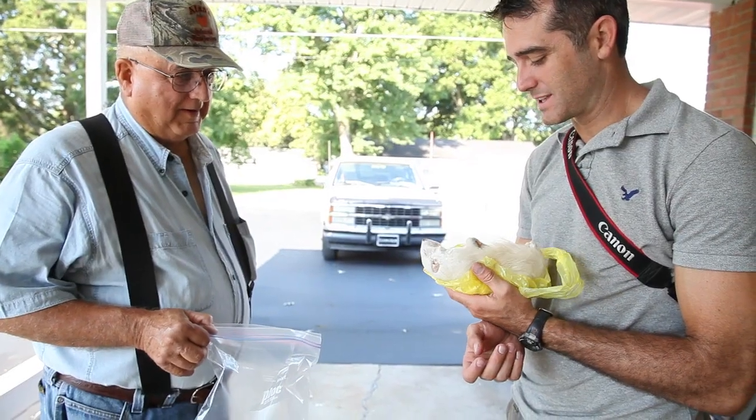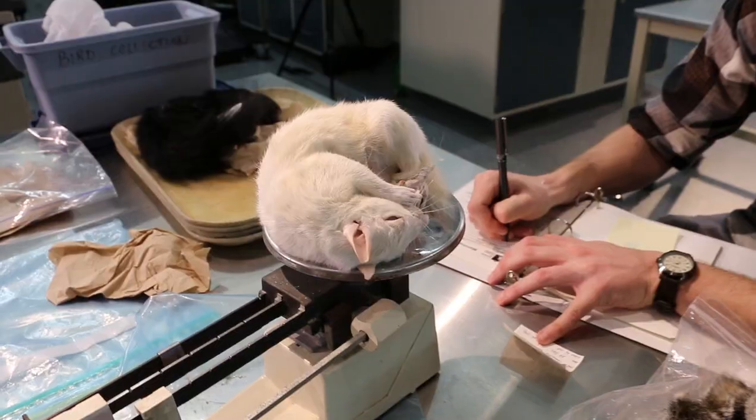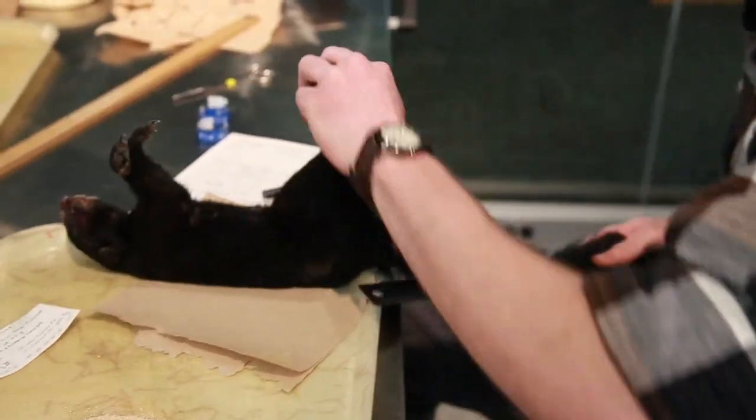The first stage when you're making a museum specimen is the data stage. You need to know where the animal came from. You've got to figure out what species it is — these are both fox squirrels. Take the measurements, and you've got to write all this down on a piece of paper.